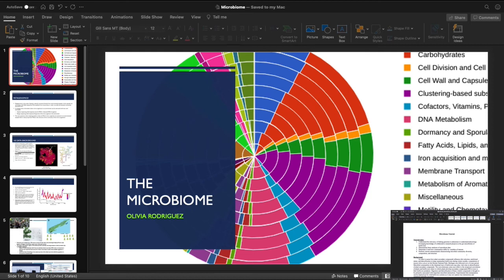Tutorial aims: you'll be able to demonstrate basic analysis of microbiome data by the end of this. You'll determine how communities can be affected by different variables of interest. You'll be able to perform basic measurements to characterize microbial data. And you'll be able to link genomes to phenomes to better understand the physiology and leverage knowledge in collaborative research projects in the gut microbiome of herbivores.